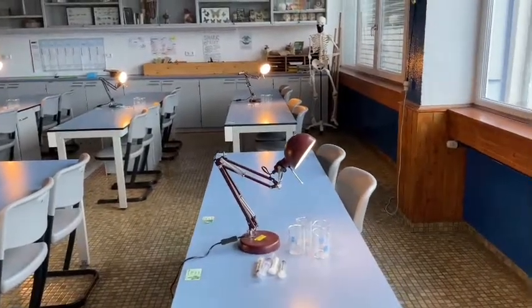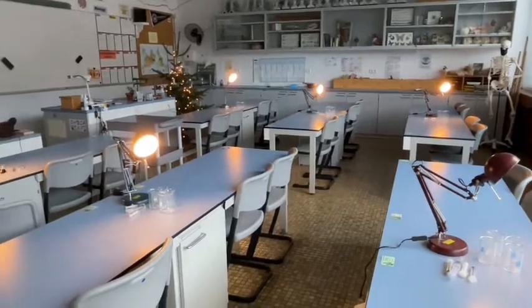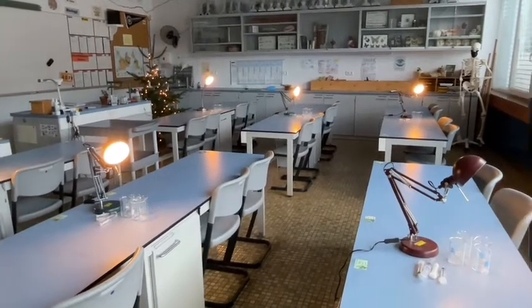I would recommend setting up this lab maybe the weekend before. So if you do this lab on a Monday, it gives you the weekend to just set everything up before.